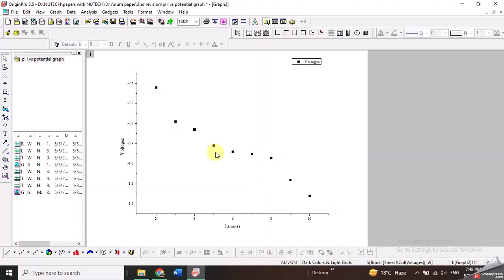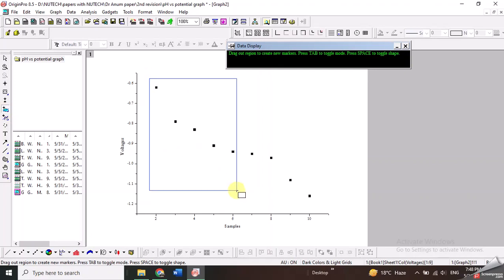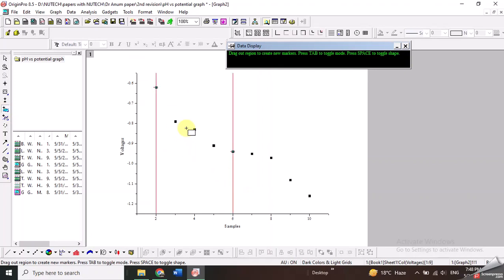To first select this data, I will go to the regional data selector option. I will click on it and select the data for which I want to draw my first straight line. As you drag it, you will see that two red lines appear, showing the selected data.